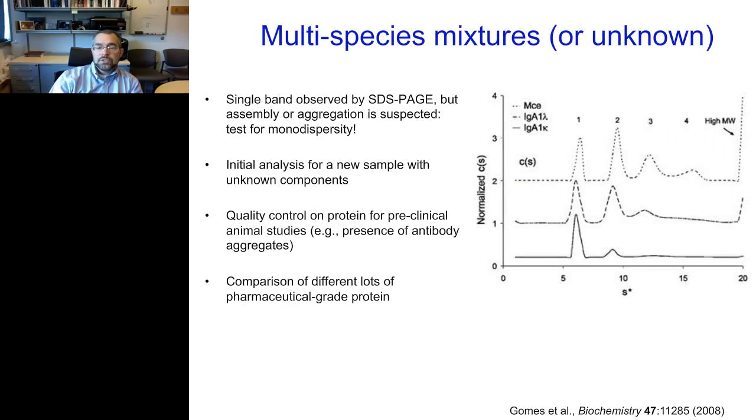All right, let me go back to something I've already alluded to a bit, and this is very powerful for a structural biologist. Again, if you have a purified protein, it's a single band on a gel, it's easy to say, I'm done, it's 98% pure, but if you really have a mixture of monomer, dimer, tetramer, and aggregate, well, that's going to be a problem. And AUC, especially the c(S) analysis by sedimentation velocity, is a very powerful way to detect that.